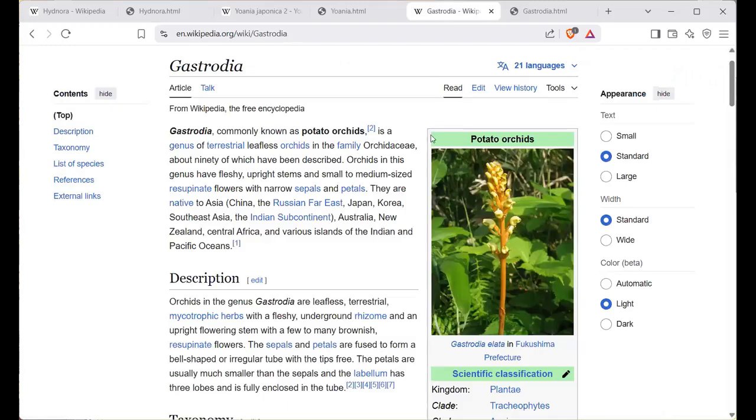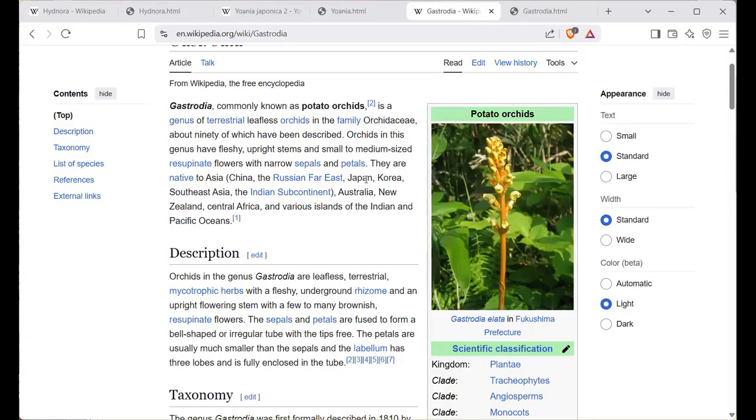And the third one I'll show is Gastrodia. This is a potato orchid. This is another parasitic plant. And you can see the PGR-TK pattern. Here, three or so are quite divergent from the rest. The length of this is 40,000. So the top ones have a length of 30,000. And you can see that the top ones are also quite divergent among each other. Maybe a few are similar to the others. These two are, for example, pairs, but most of them are quite divergent.